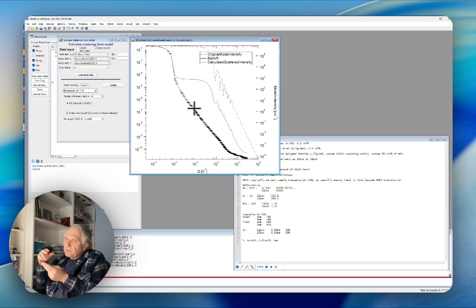The anomalous calculator will also calculate for you the sample transmission at the energies which we offer. So most likely, if you're planning on anything without any special requirements, we would offer 21 kiloelectron volts. So you can go back and calculate how thick your sample needs to be for the energy at which you will be operating it. 21 is a good choice.